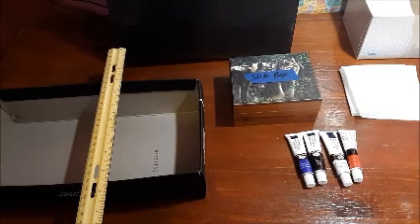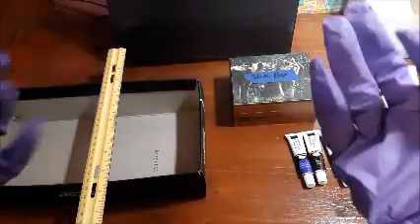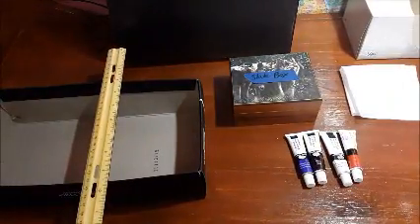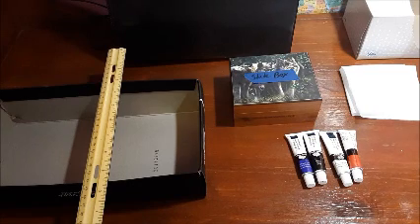And like I said before you start any experiment, make sure that your space has been disinfected with germicide and wiped down with paper towels. And when you're done with the paper towels, just put them in the biohazardous waste container. But since we're continuing on with the experiment, also make sure that you have a new pair of clean gloves on and that you have your lab coat and a pair of goggles on, because with this staining procedure, things can splatter, so just want to keep ourselves safe.